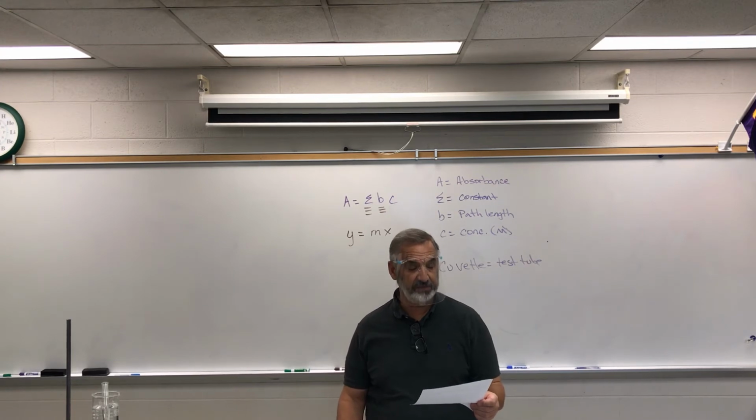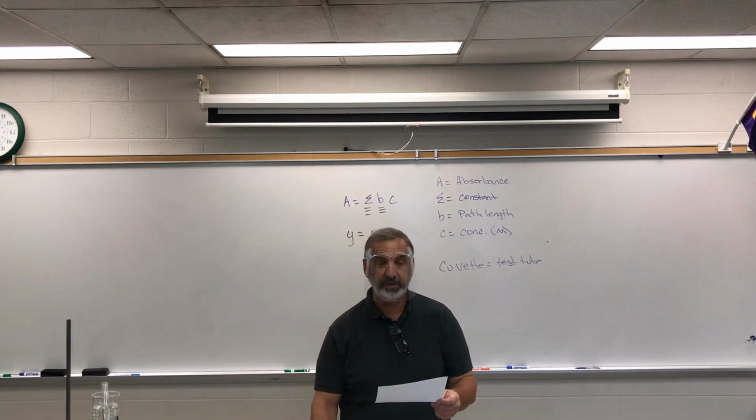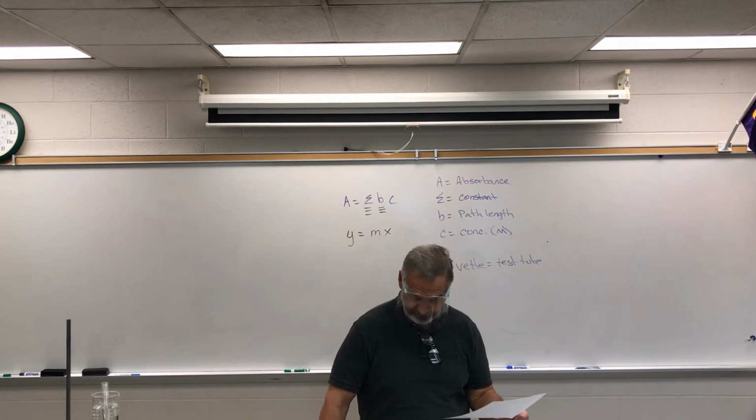You see that right there on A1? You're going to change that to a 0.100 molar. Procedure A, directions 1, 0.100. The 0.25 is too concentrated for the machine to pick up. I copied this lab from somebody else, and their machine was better.